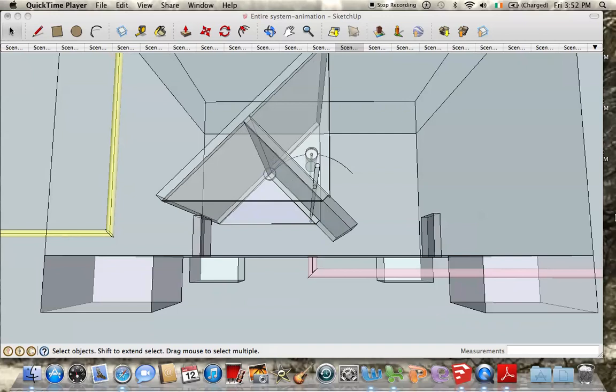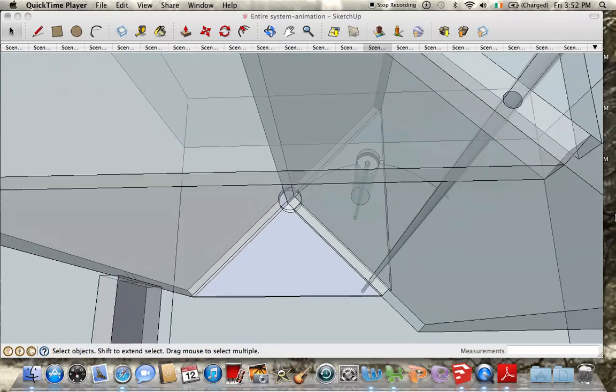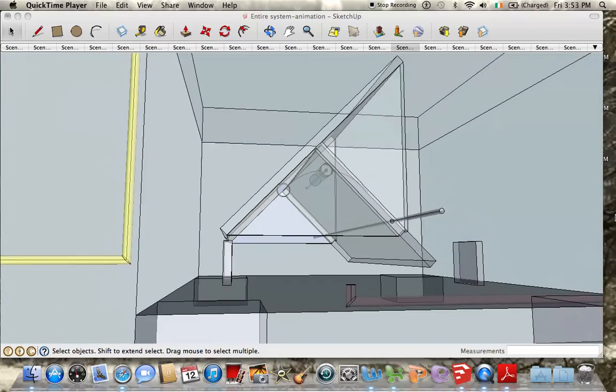The bucket is submerged in water, and as the gas bubbles up through the bottom of the tank, it is forced into the cavity that we can see clearly here. The biogas congregates here in the cavity until such time that the upward pressure of the gas exerts enough force to tip the bucket over. The bucket will tip along the axis as seen on the right, from left to right.